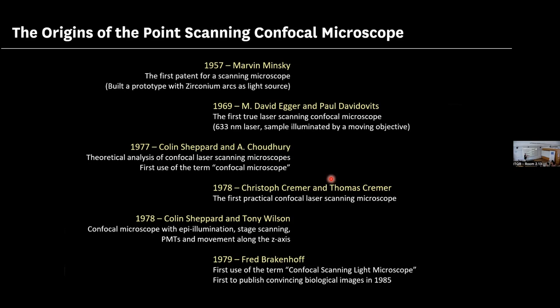Colin Shepard and Tony Wilson actually developed a very interesting confocal microscope already with epi-illumination using the same objective. The stage was scanning, not the objectives, because in previous designs, they put the objectives that were moving, and they could also move along the Z-axis. And in 1979, Fred Brakenhoff, he was actually the one in the publication that came up with the term confocal scanning light microscope. And he was the first to publish convincing biological images.